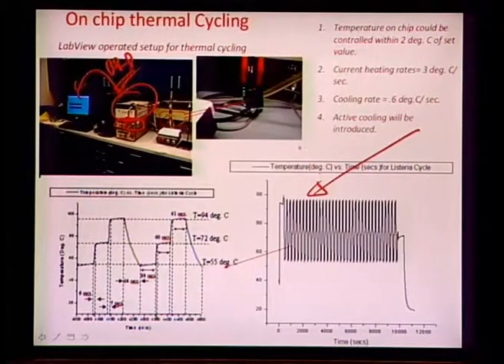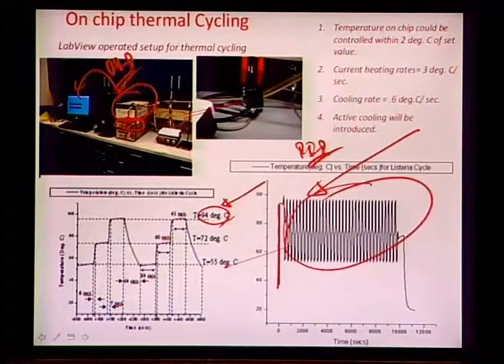You have to, of course, develop the PID parts experimentally using Ziegler-Nichols or any other algorithmic method, but essentially the idea is that as the heater power is switched on, there is a ramp up of the temperature, and as it is switched down, there is a ramp down. And the idea is that if I have an executable file, maybe a doc file, which contains the information about what time what temperature is to be held on the top of the chip, we can use that with the PID controller to control the sequence of temperature time steps, as can be illustrated here.